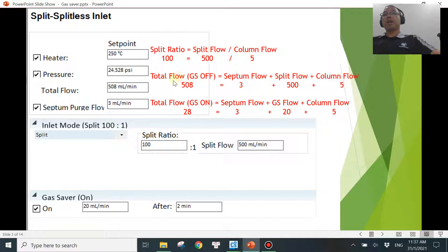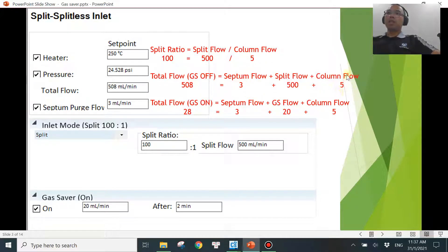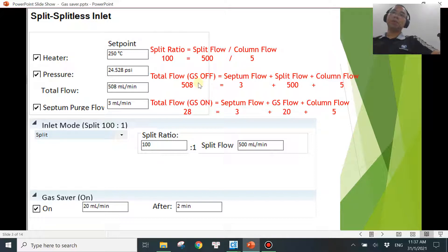When it comes to total flow, it's a combination of septum flow plus split flow plus column flow. If gas saver mode is off, you have a septum flow of about 3 mL/min, a column flow of 5 mL/min, and a split flow of 500 mL/min. So in total, you will be consuming about 508 mL/min of carrier gas — helium, nitrogen, argon, whatever — every single minute if you turn off gas saver mode.